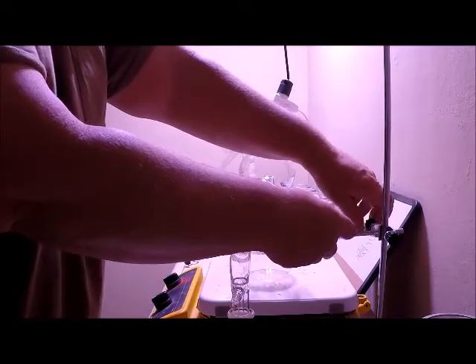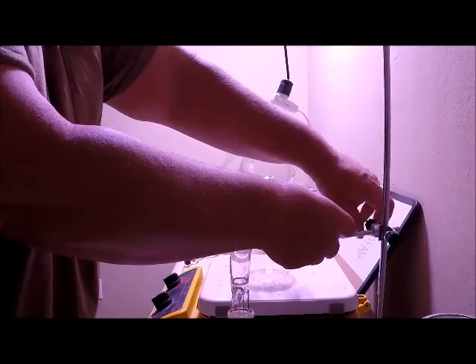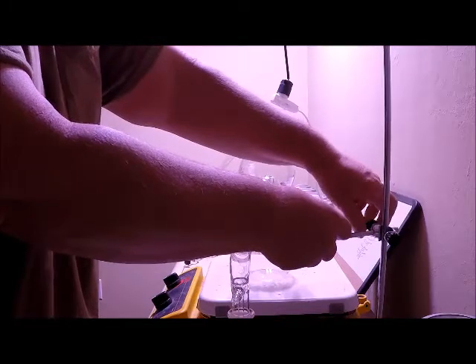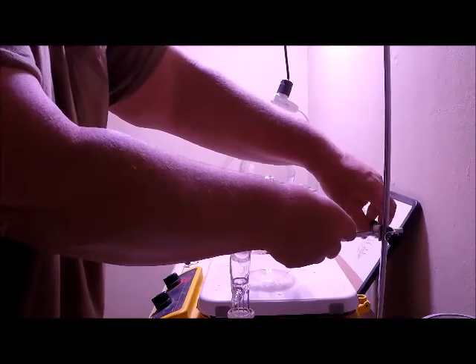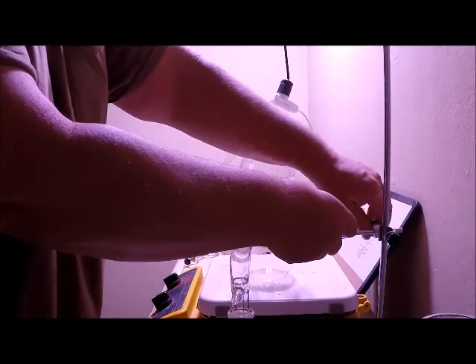I may or may not need it for this exact setup, but as I start adding more pieces to the distillation train in the future, it probably will become necessary to start having some clamped ends.